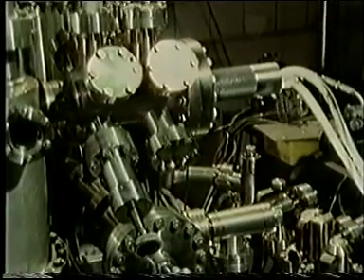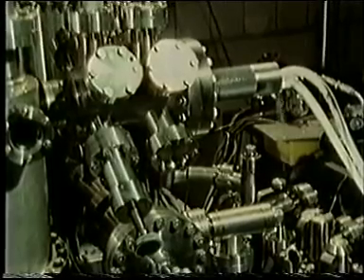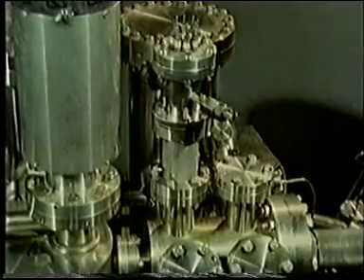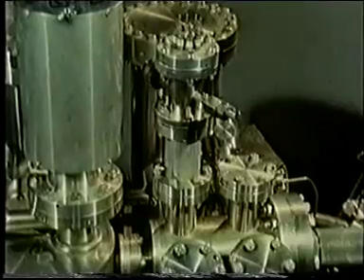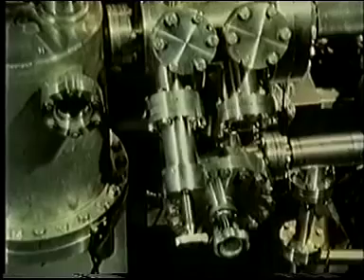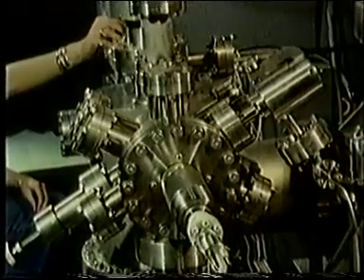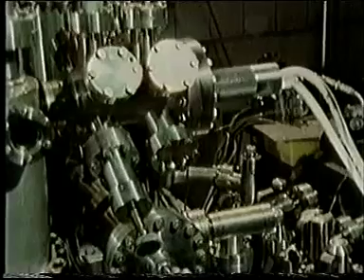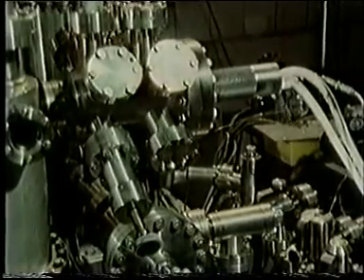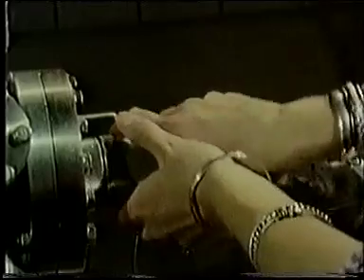The cleaning is done in a side chamber. Here, the surface of the slice is repeatedly bombarded with ions from an argon-ion gun. The bombardments are interspersed with bouts of heating and cooling to even the surface out. This side chamber can also be used when we need to expose a surface to gases near atmospheric pressure. But this isn't necessary in this experiment, so the sample can be moved through a gate into the main spectrometer chamber.